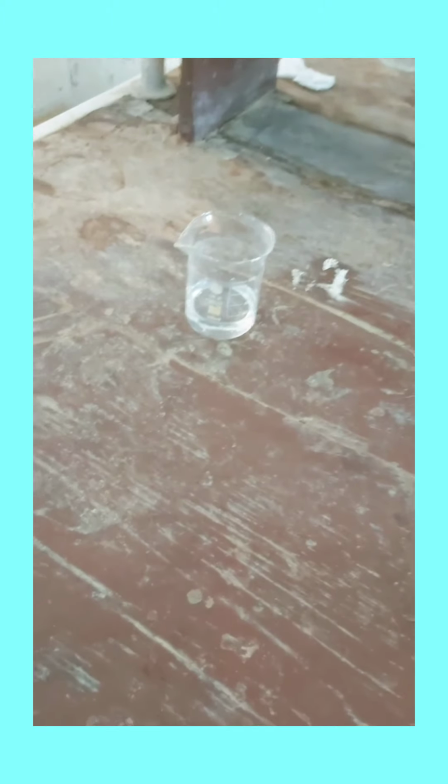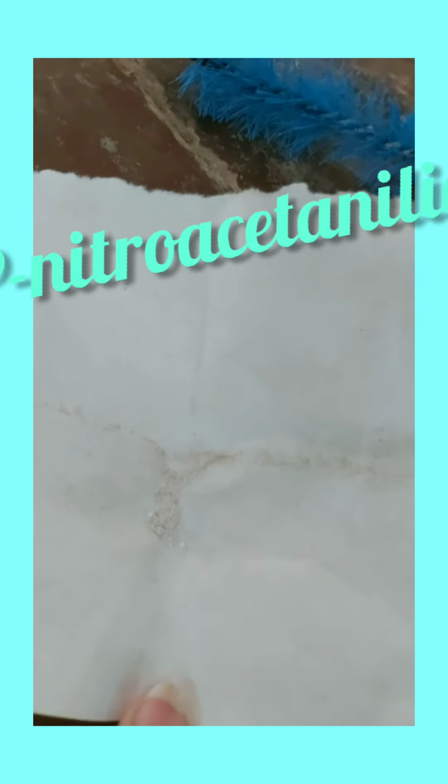As I was telling, my students were preparing the compound, and they have now prepared it. This is it. This is para-nitroacetanilide. Its yield is very little, but with the passage of time, over months, they will come to know how to make it in bulk.